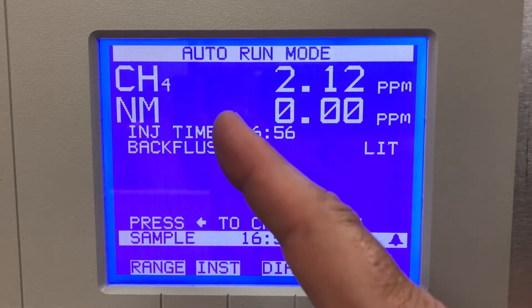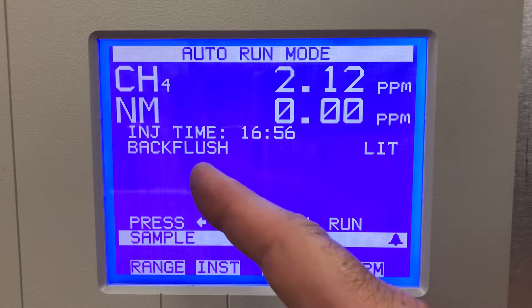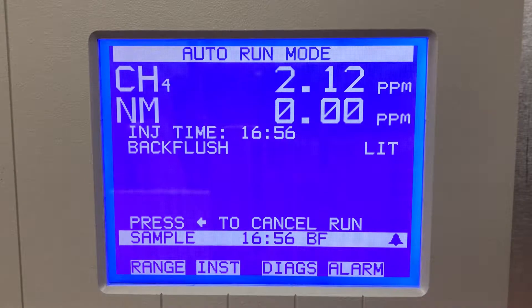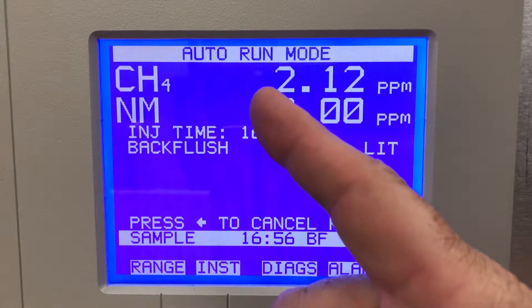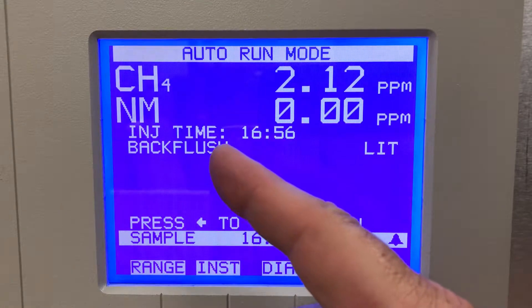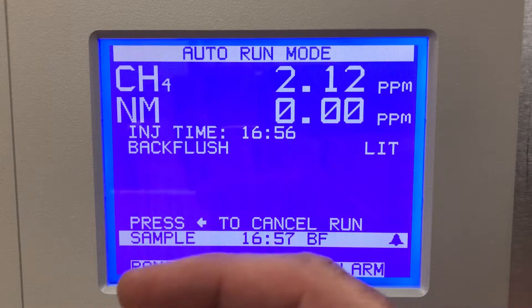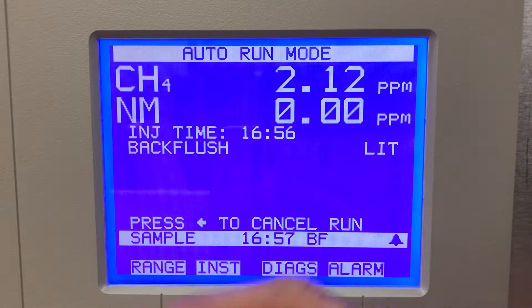It'll go through a backflush. The way this unit works, it will measure the methane component first, and then the non-methane is measured on the backflush. This is using nitrogen as a carrier through the column, so methane will come out first as the peak. Then on the backflush, non-methane will come out. To do the backflush, there's an 8-port valve inside this unit which is switched every few seconds to change the direction of the carrier nitrogen through the column.